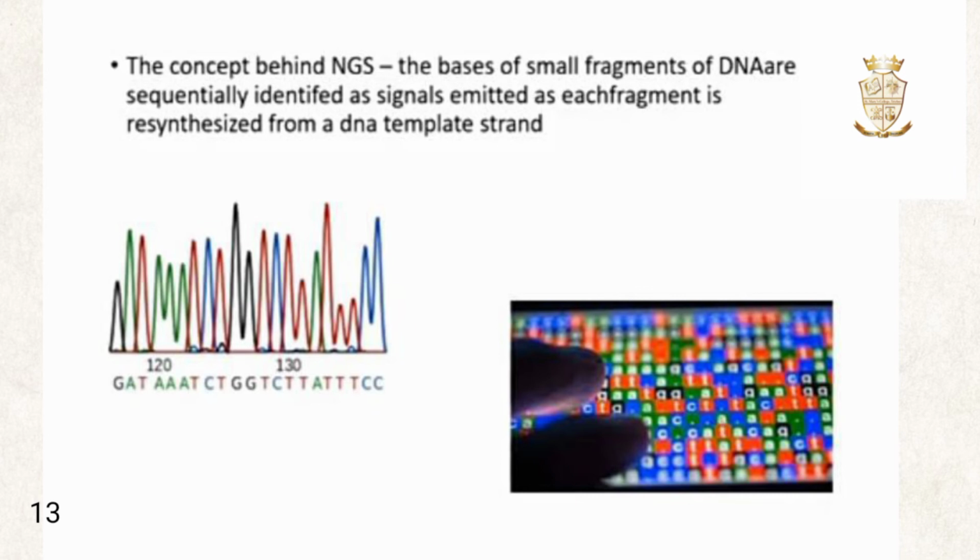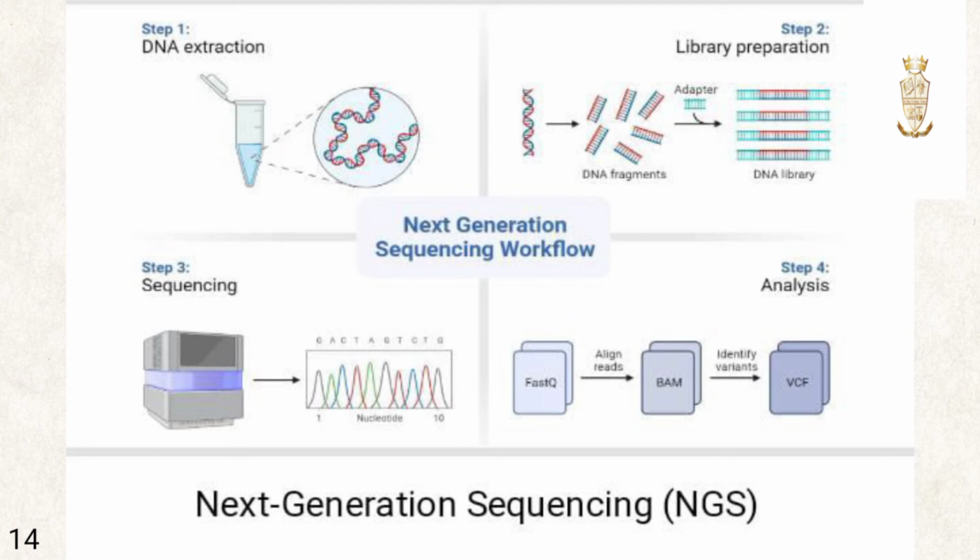The main concept behind NGS method is that the bases of small fragments of DNA are sequentially identified as signals emitted as each fragment is resynthesized from a DNA template strand. These are the steps of NGS method: DNA extraction, library preparation, sequencing, and analysis.